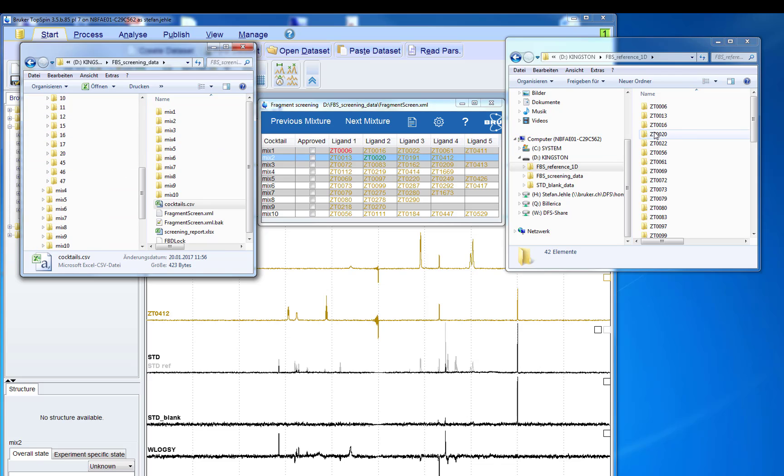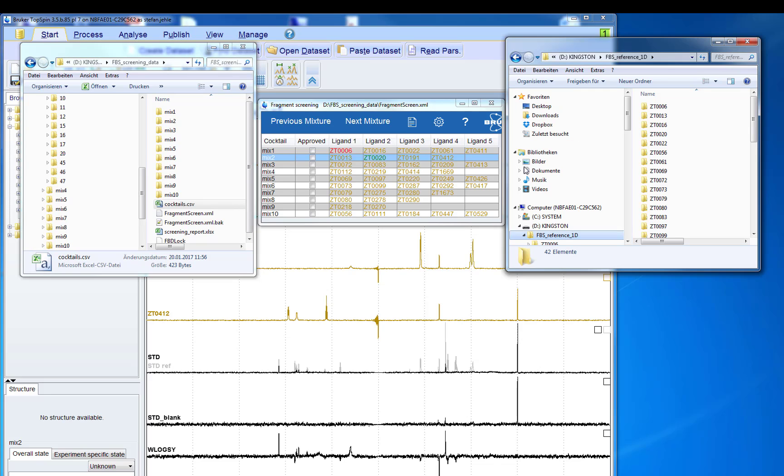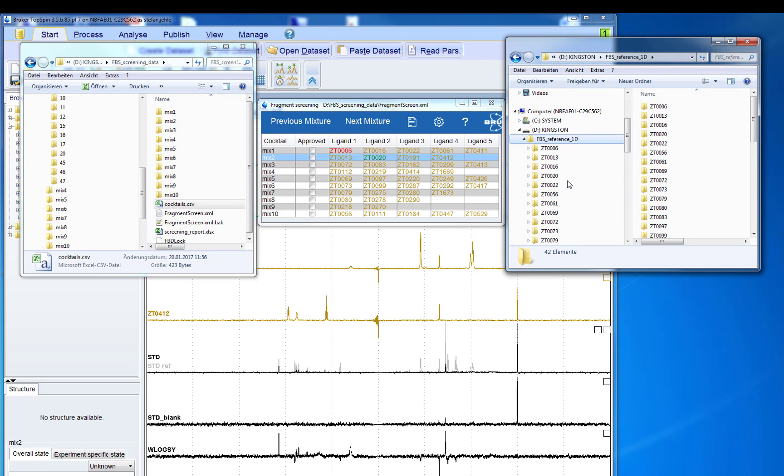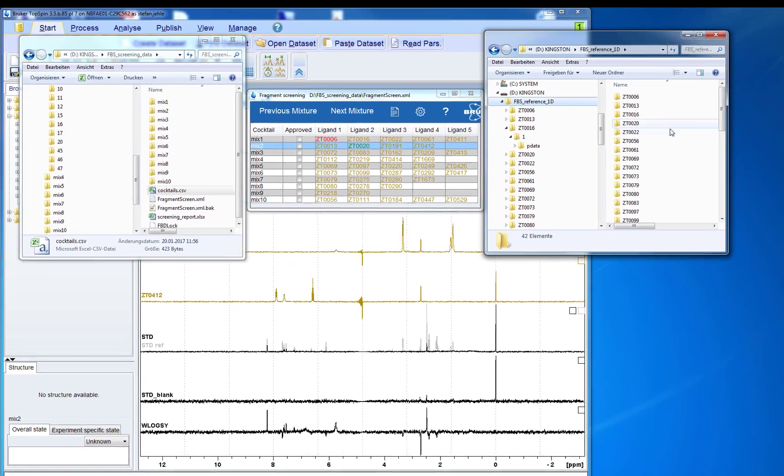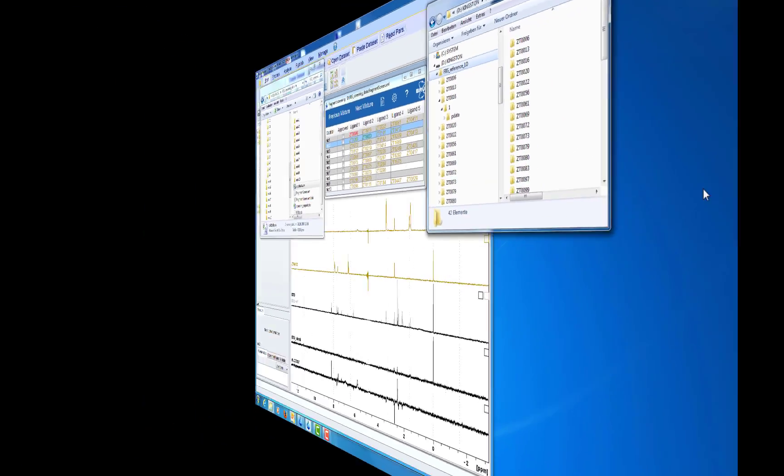For each compound in the library a 1D proton spectrum should be measured that should be saved in a dataset with the unique compound ID as the name.